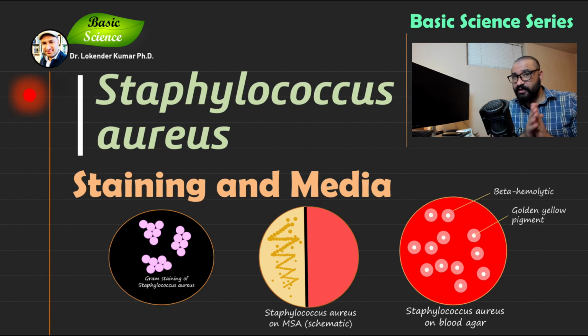I hope that you have seen my previous video on Staphylococcus aureus, where I discussed all the important points and touched the base on those specific points. Here I'm going to elaborate on some of the important points. For example, gram staining. I will also discuss the MSA profile. MSA is the Mannitol salt agar profile, and I'll also discuss the blood agar profile.